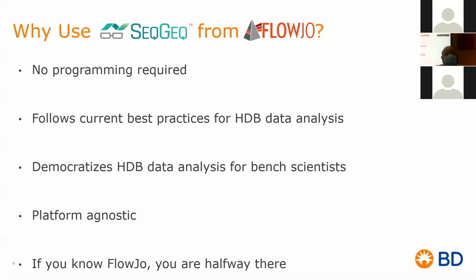Also, it already follows the best practices for high dimensional data analysis, and it democratizes the analysis to your bench scientists. So most people that are using this, immunologists, now have access to what before was more for geneticists, or limited to bioinformaticians, where if you ran an experiment, you needed to wait months before your bioinformatician got back to you.